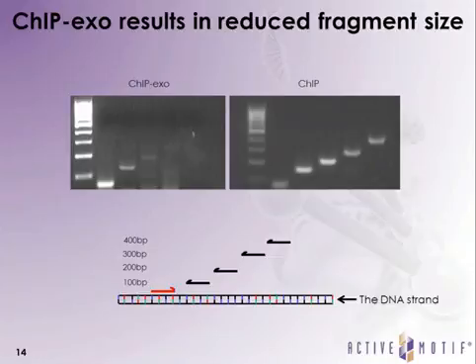You can determine this from the ENCODE databases if it's known, or maybe from your own experiments with ChIP-Seq. And you can design primers to the 5' running 5' to 3' being your universal primer, and you have reverse primers that you then walk out from the initial known binding site between these primers at 200 base pairs, 300 base pairs, and 400 base pairs away. And then you can compare this with ChIP data.